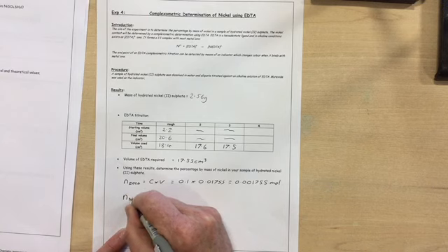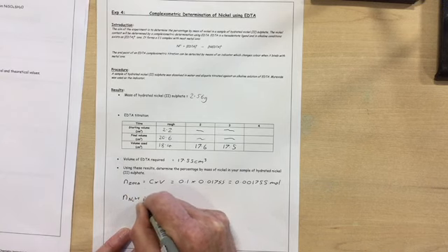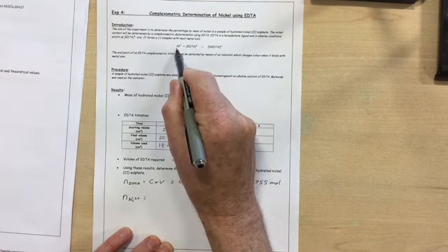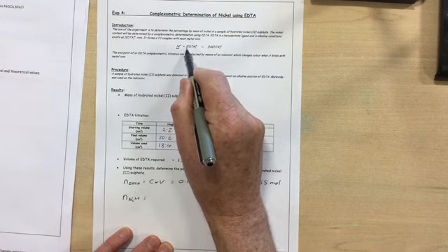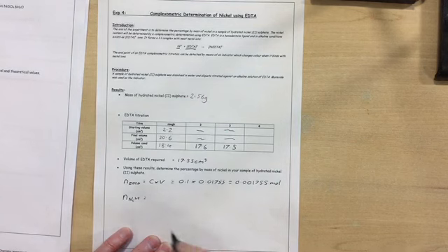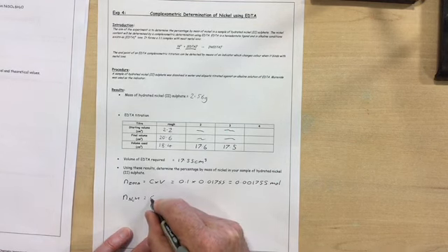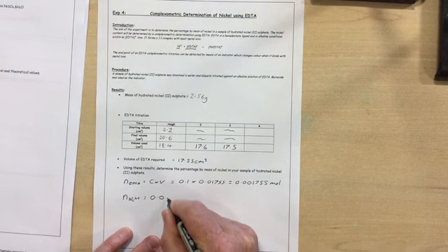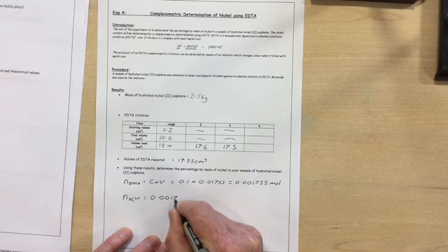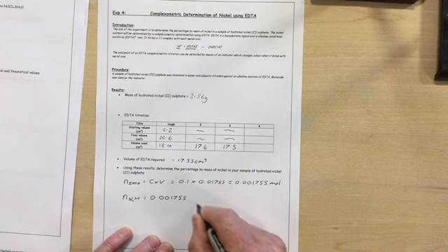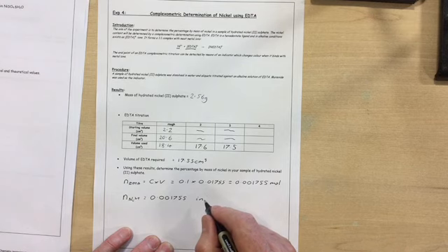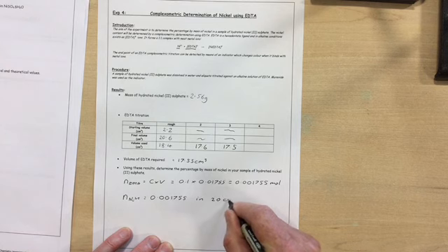Now the number of moles of nickel ions. If you remember the nickel and EDTA react in a one to one ratio, so we've got the exact same number of moles of nickel. That was in the volume of nickel we put into the conical flask for the titration which was 20 cubic centimetres.